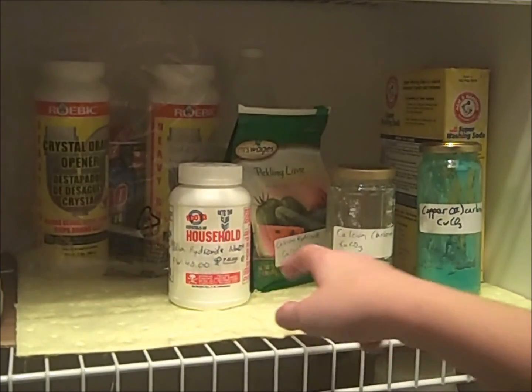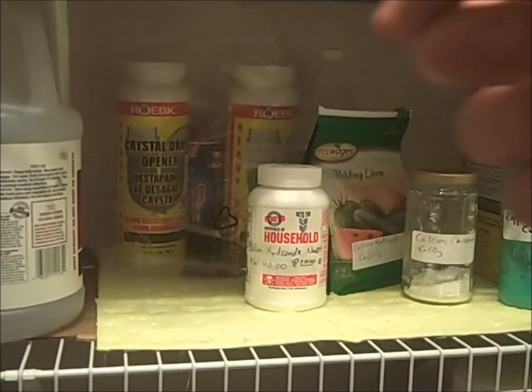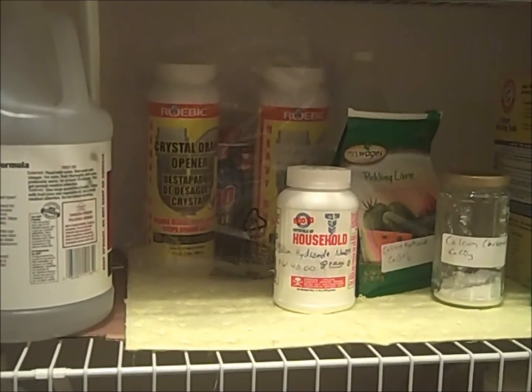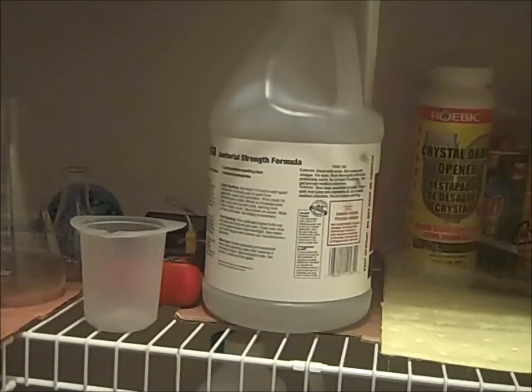Sodium hydroxide is sold under many different brand names as Rooto Crystals of Household Lye, Roebic Crystal Drain Opener, and in the back, Drano also contains sodium hydroxide. It is generally approximately $10 per kilogram. This is janitorial strength ammonia, which is 10% by weight.